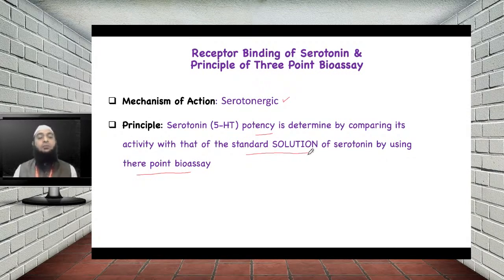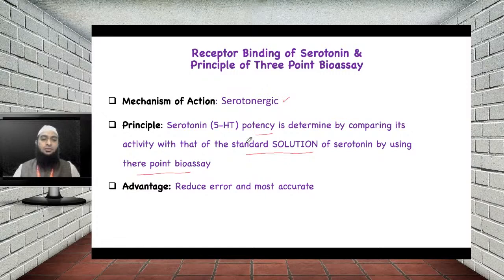Just remember that in this experiment we are comparing the potency of the standard and the test solution, and we are determining their concentration by using the concept of 3-point bioassay. So this is the principle. Let's see what the advantages of this experiment are.